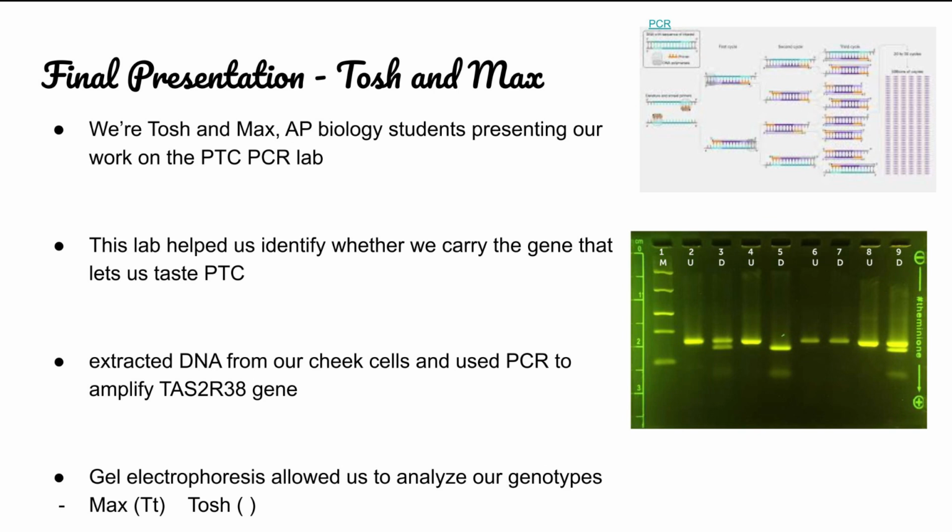After amplifying the gene, we used gel electrophoresis to separate the DNA fragments and visualize our genotypes. Based on the band patterns in the gel, we found that Max is a heterozygous genotype, uppercase T and lowercase t, and Tosh also has a heterozygous genotype.